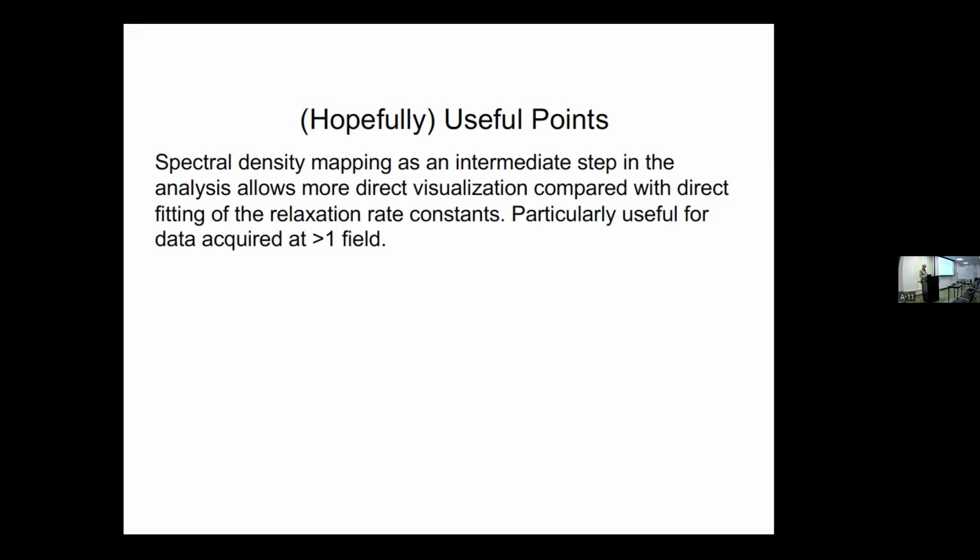If you look at the tables at the end of one of the lecture notes, deuterium relaxation just depends on J0, J at the Larmor frequency for the deuterium, and J at the double quantum frequency for the deuterium. So a relatively small number of relaxation rate constants gives you enough data to invert those equations.